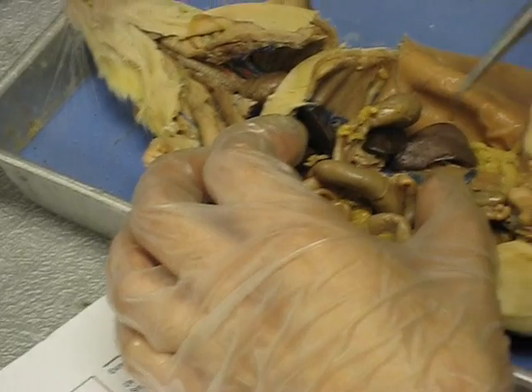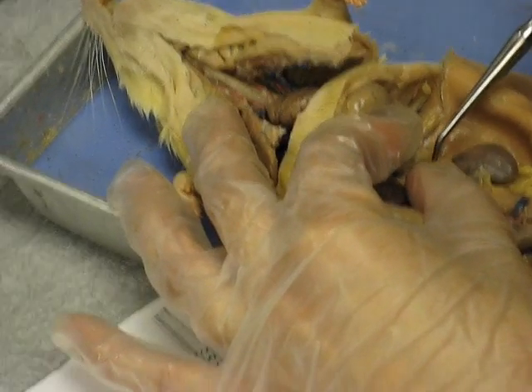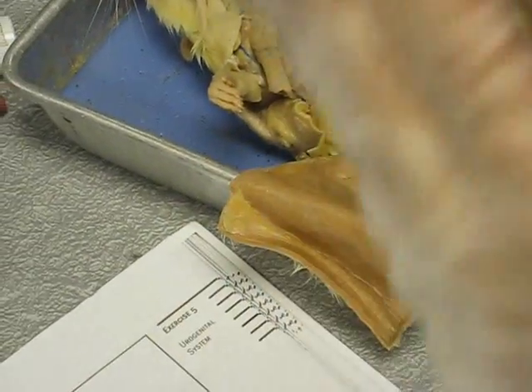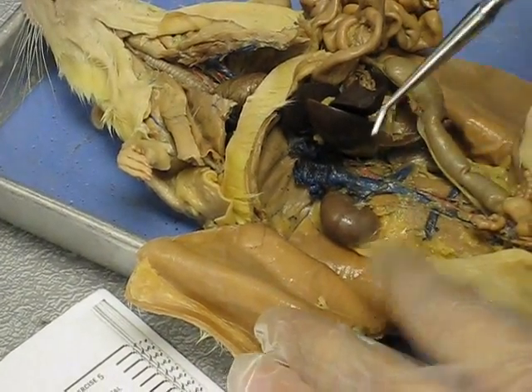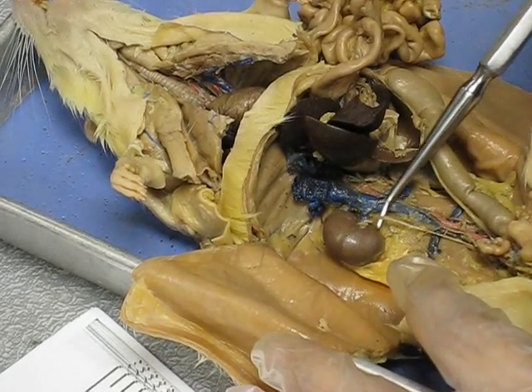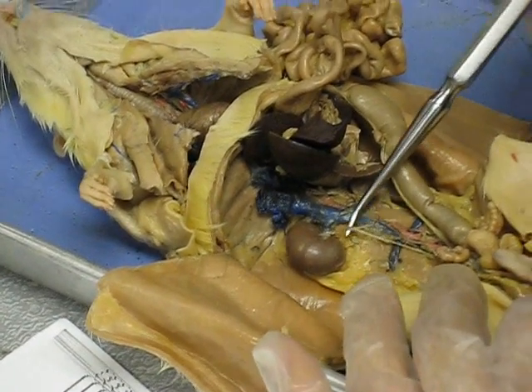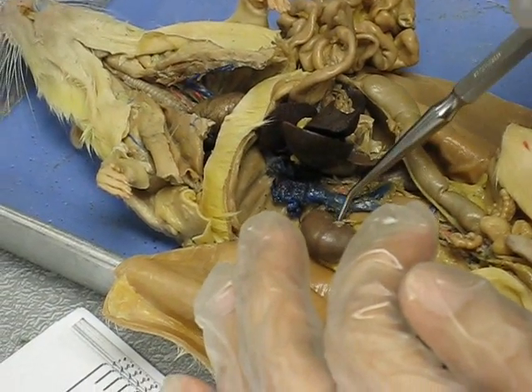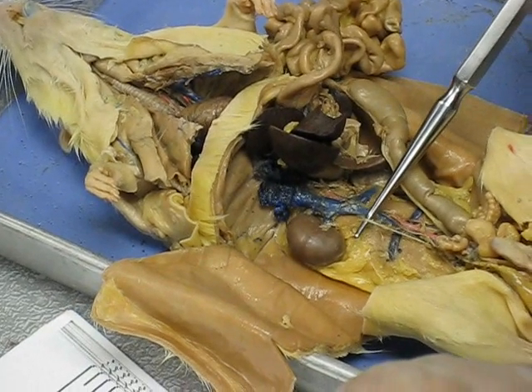Don't confuse the spleen with some of the lobes of the liver — it's going to look like a tongue. There's the spleen. What is this organ here? The kidney. Right above the kidney is a little small circular organ — the adrenal gland. The right kidney is always positioned higher than the left kidney — that's just how they are. Leading from the kidney to the urinary bladder is the ureter. It's tiny, so don't worry if you can't find yours — you might have already cut it.